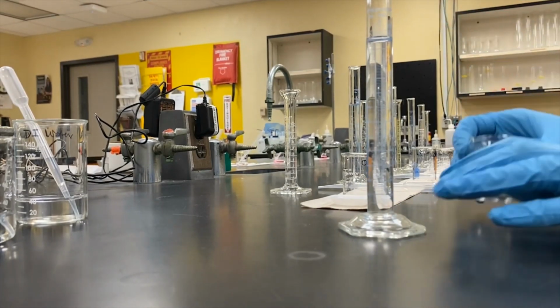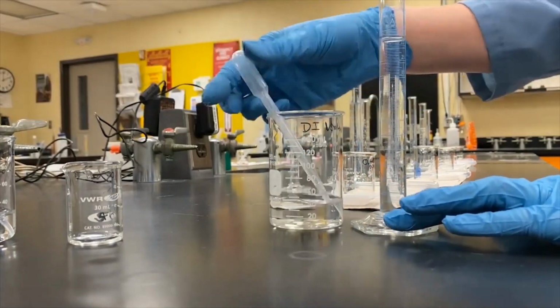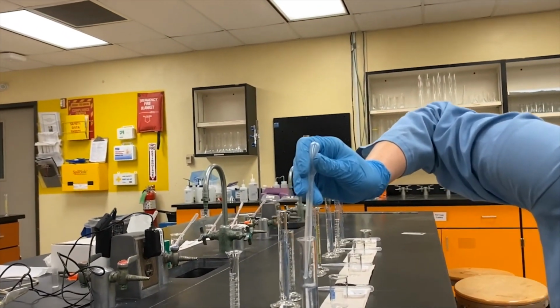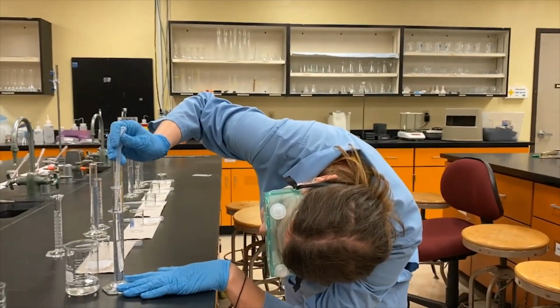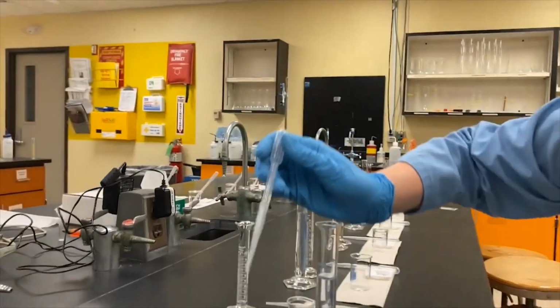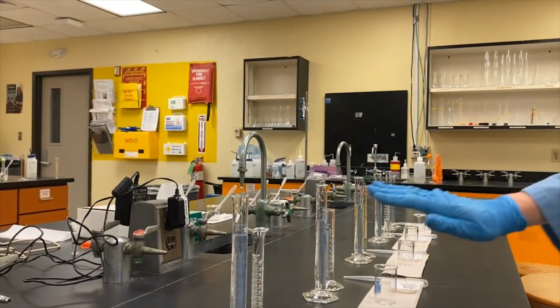So I'm going to stop before I hit the line because I don't want to over pour, and then I'm going to grab a disposable pipette again so I can get closer to the mark. And same thing, I'm going to bend at the hip. Make sure that line is lined up, and fill my meniscus to that line. So we've done that in all of these cases here.